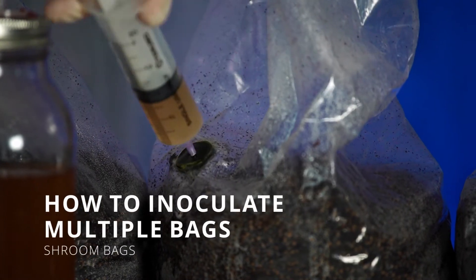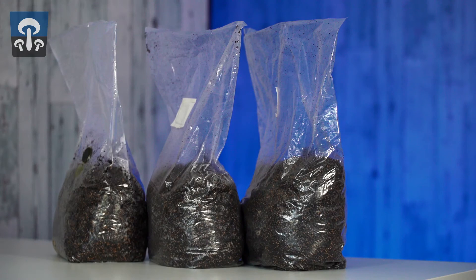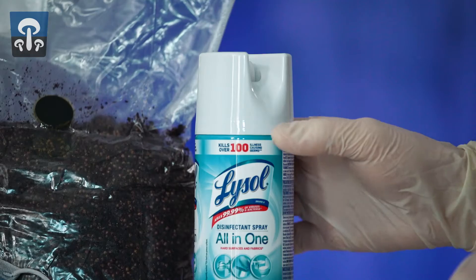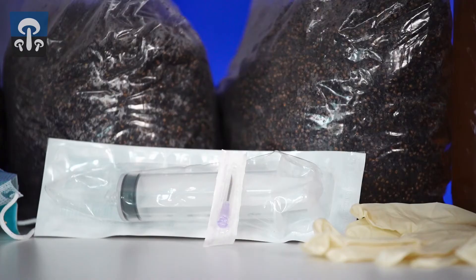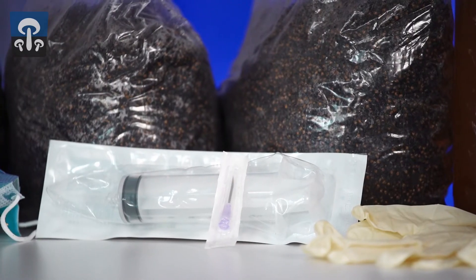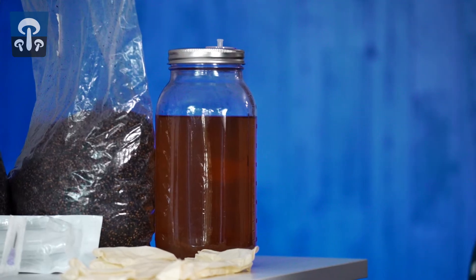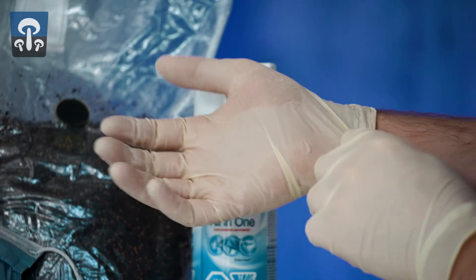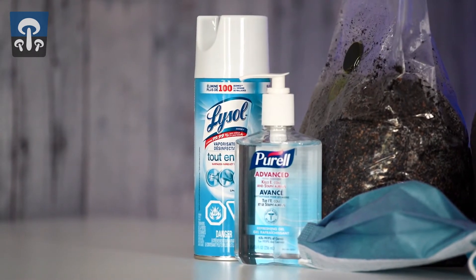In this video, we're going to be knocking up multiple bags at the same time. You will need multiple bags for inoculation, a can of Lysol, a face mask, a 60cc Luer-lock syringe, a 16 gauge needle tip, a jar of liquid culture, a set of gloves, and optionally you may use Purell to reduce contamination rates.